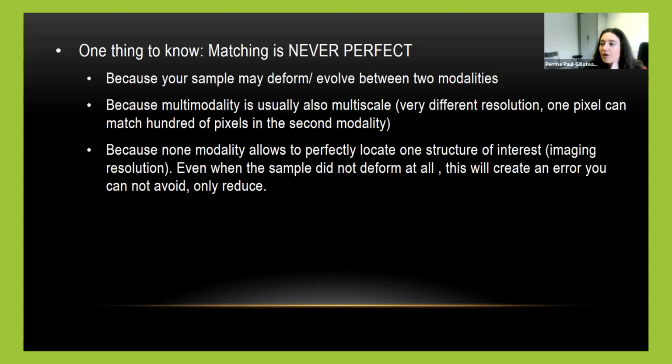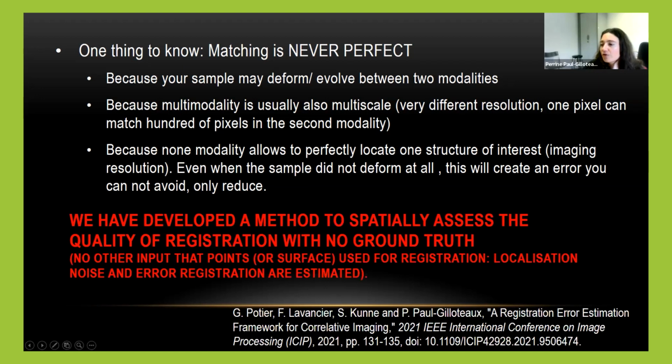And also because there is no perfect location of any points that you use to register your images. It means that you will get an error, even if you don't have any deformation, even if you are perfectly good, you will always get an error due to the fact that you don't have an infinite resolution and a perfect localization of objects in the microscopy images.